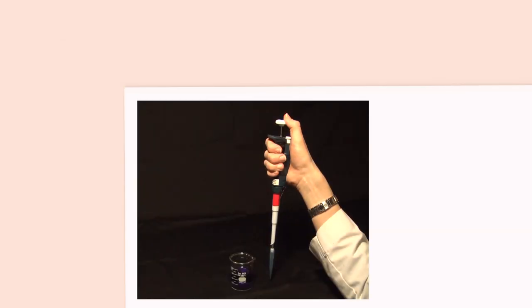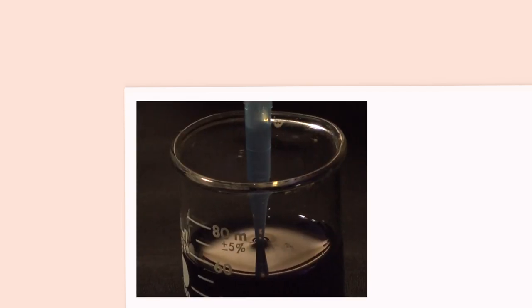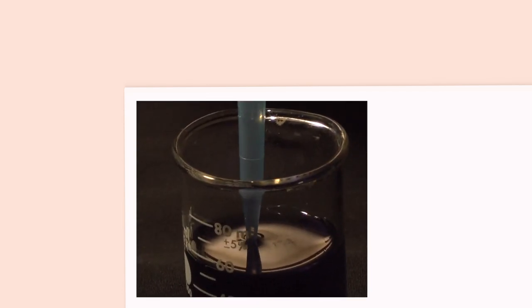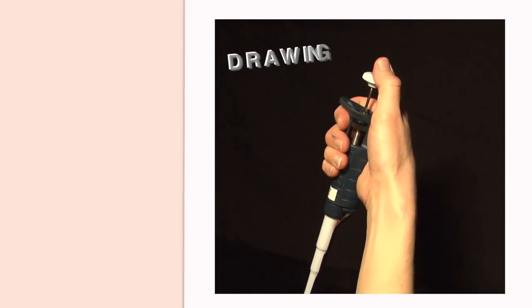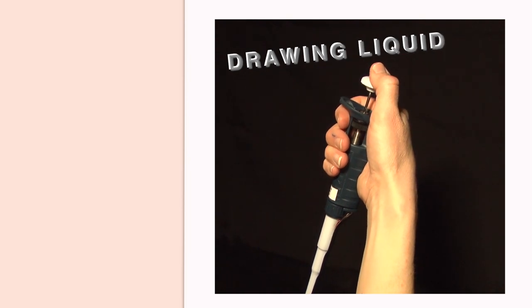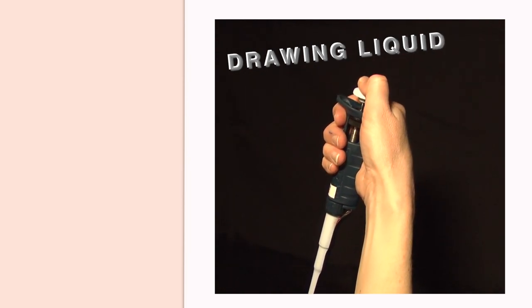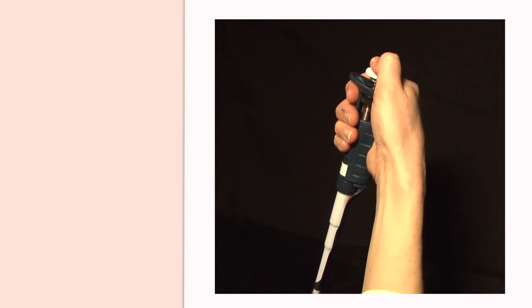Pressing and depressing the plunger will allow you to draw liquid into the disposable tip, and then to dispense the liquid. To draw liquid into the tip, press the plunger down until you feel the plunger gently resist. This is the first stop.